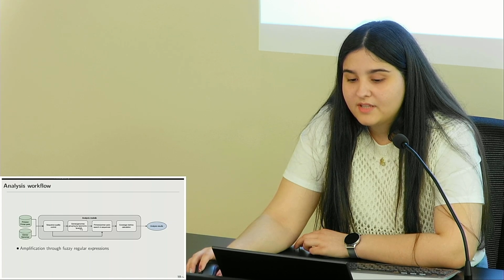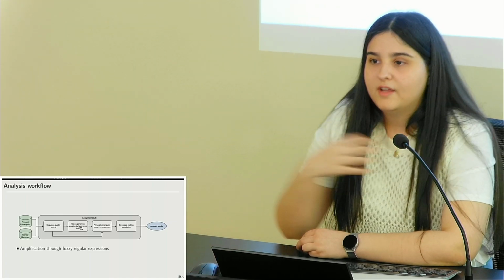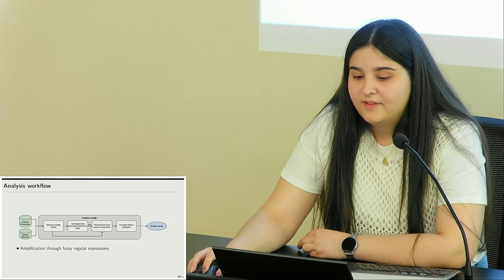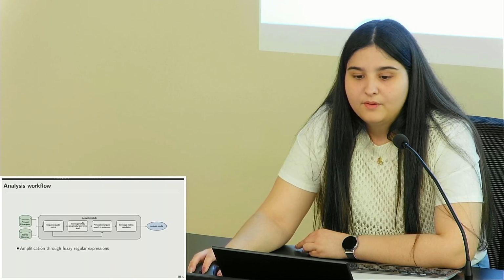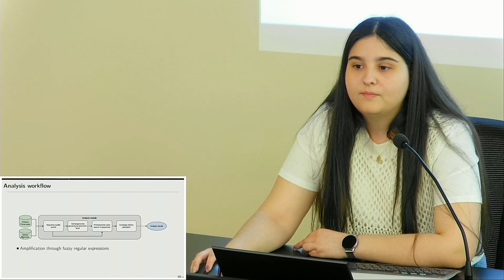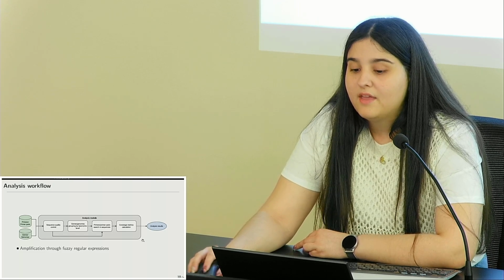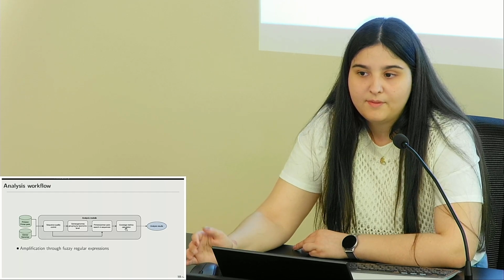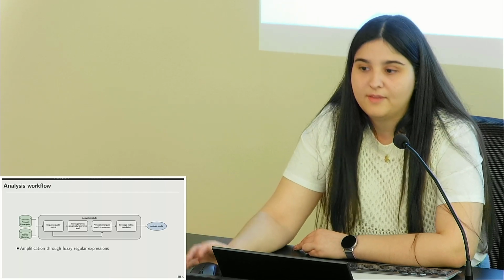The step that we skipped is a step for grouping the target sequences depending on a specific taxonomic level. For example, we may want to group these genomes by species, and then the calculated coverage will be the number of species amplified by the primer instead of the number of genomes amplified by the primer.